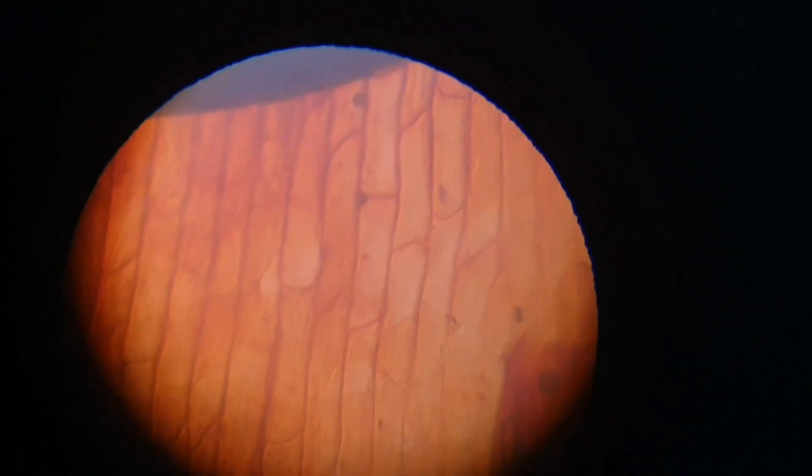Observations: there are a large number of cells lying side by side with distinct cell walls. A distinct nucleus is present on one side of the cell. A big vacuole is present in the centre of the cell.